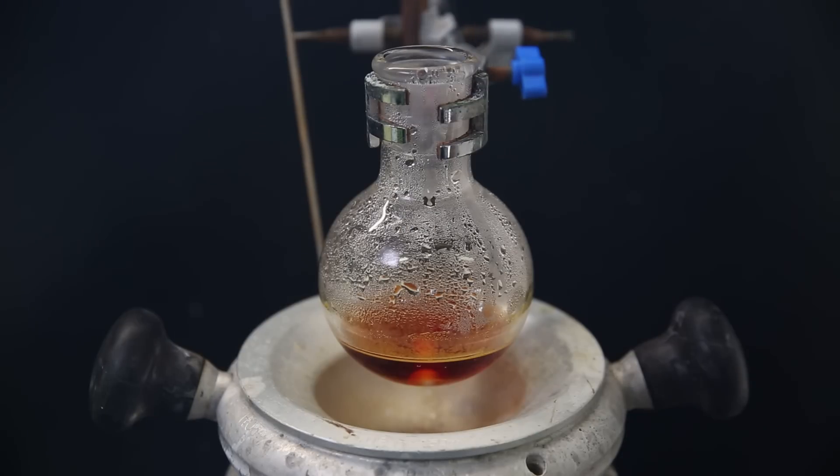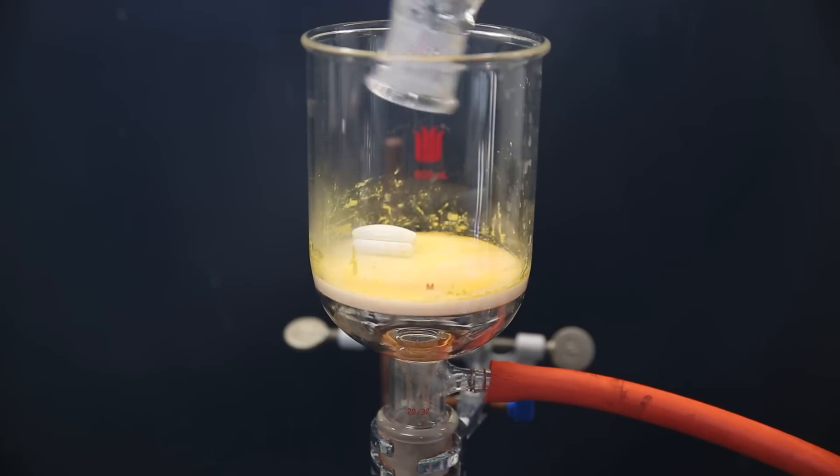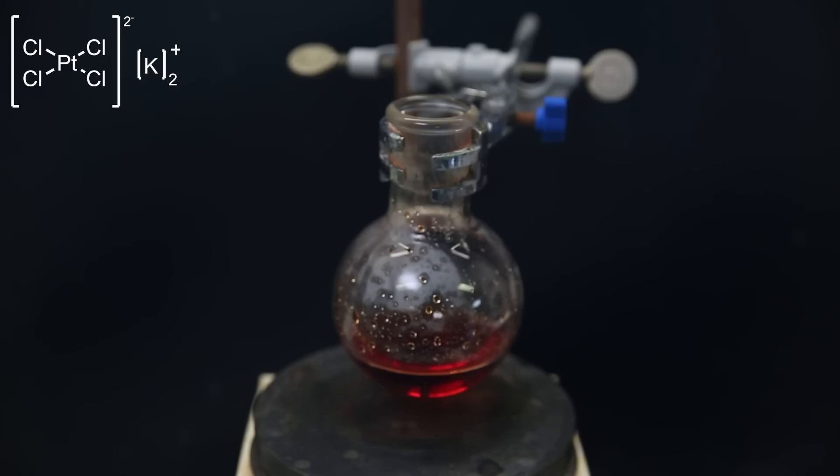When almost all of the solid is gone, I stop adding the sulfur dioxide, because if it is added in excess, it can form complexes, which is not desirable. I then filter it through the same filter that still contains some hexachloroplatinate from before. I wash it down with some water, and I am left with a red filtrate containing potassium tetrachloroplatinate.